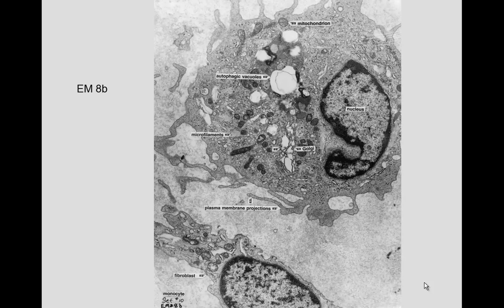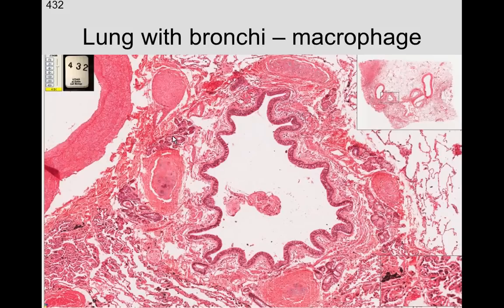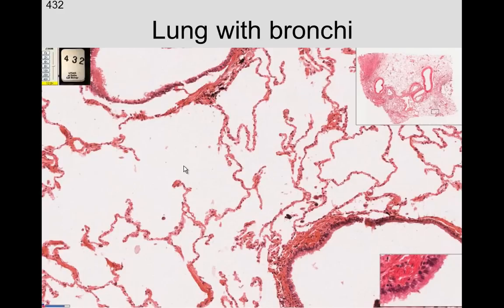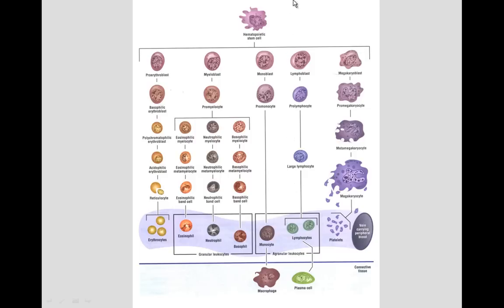The cells migrating out are likely neutrophils. A monocyte is also visible with lots of cytoplasm, a euchromatic nucleus, and projections associated with macrophage development. On slide 432, from a lung of an animal fed carbon, the macrophages have taken up colloidal carbon and are visible in the air spaces, demonstrating the important function of monocyte-derived macrophages in the lung.